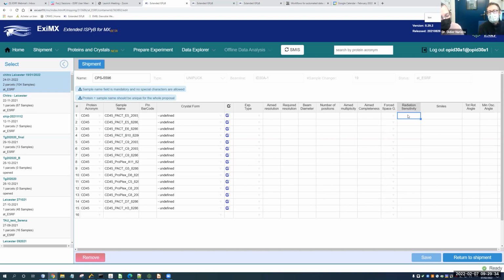If you've got something very specific like that, you're probably better off contacting us beforehand, because we could do a specific workflow that limits the dose. We've done this for people before who have a very specific dose limit.